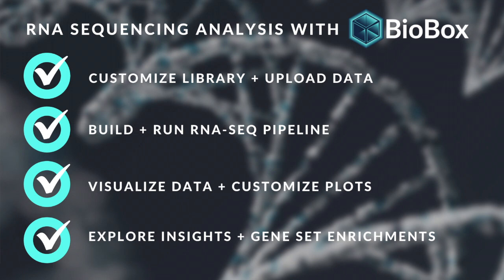So now you have uploaded the data, organized and processed the data running a bioinformatic pipeline, visualized your data using heat maps as well as Volcano plots, conducted a gene set enrichment and looked at all the pathways that are differentially expressed or upregulated and downregulated in your experimental and reference samples, and also did a little bit of a literature review and looked into public data that's available to learn more about your data. And that is how you do a comprehensive RNA sequencing analysis from start to finish on the BioBox platform.